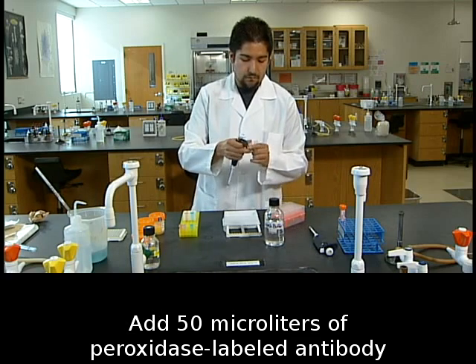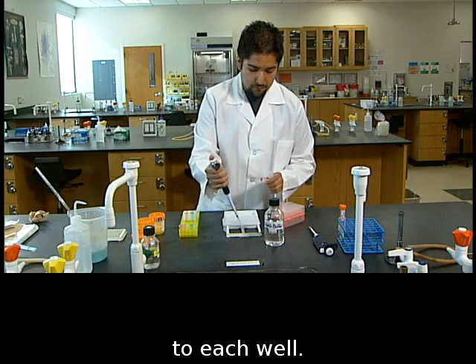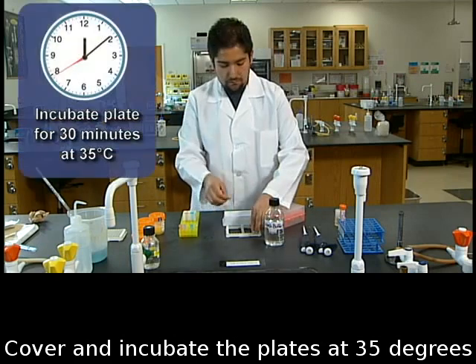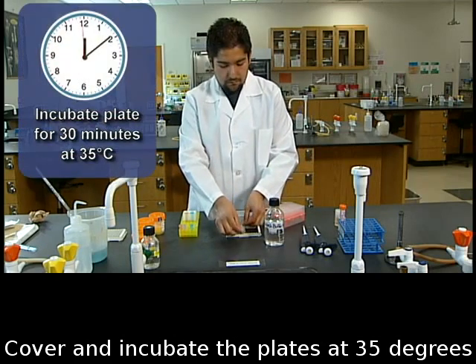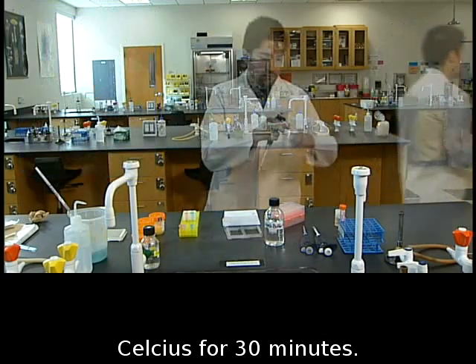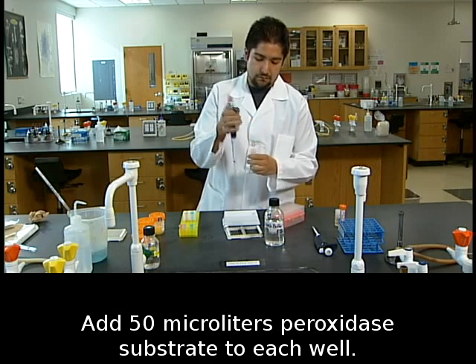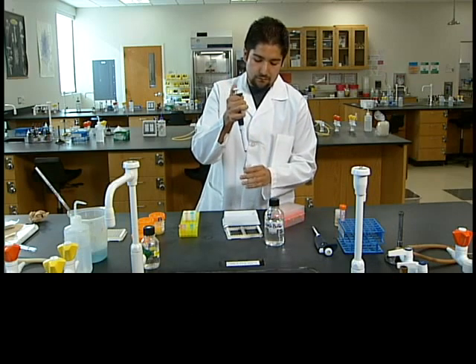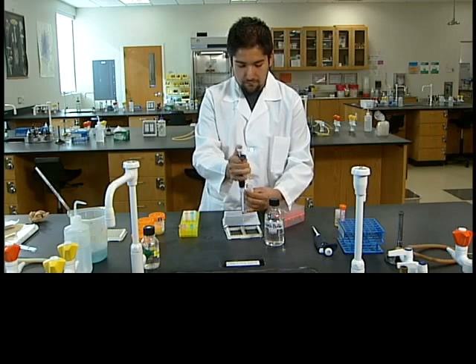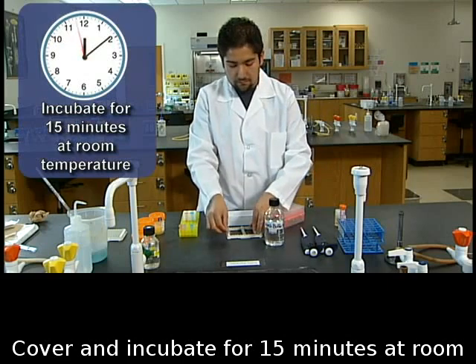Add 50 microliters of peroxidase-labeled antibody to each well. Cover and incubate the plates at 35 degrees Celsius for 30 minutes. Add 50 microliters peroxidase substrate to each well. Cover and incubate for 15 minutes at room temperature.